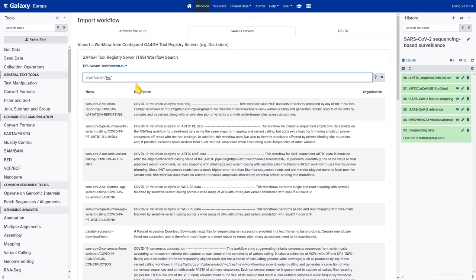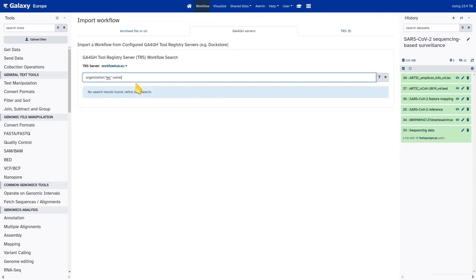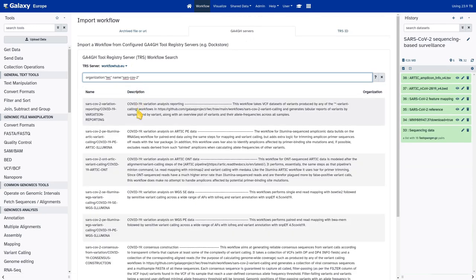I'm now filtering for all workflows contributed to WorkflowHub via the Intergalactic Workflow Commission — a group within the Galaxy project that takes care of producing high-quality workflows for different kinds of analysis, reviewing those, and submitting them to WorkflowHub and Dockstore. I'm looking more specifically for SARS-CoV-2 workflows, so I'll include the search term 'name:sars-cov-2'. Filtering for the workflows of interest: our example data is Illumina paired-end sequenced using the ARTIC primer scheme V4. So 'SARS-CoV-2 paired-end Illumina ARTIC variant calling' seems to be the one we want.